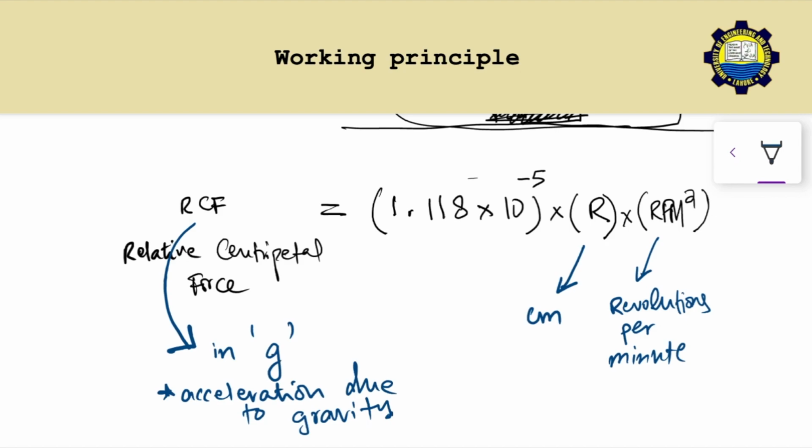That counteract the centrifugal force acting on the suspended particles. So there's a buoyant force. It's the force with which the particles must displace the liquid media into which they sediment. The second force that counteracts the centrifugal force is the frictional force. It's the force that is exerted on the particles as they migrate through the solution.